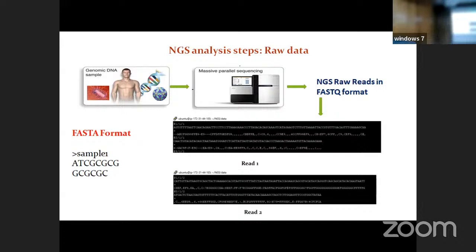So for example, you will take 3 samples. You can't expect that the false discovery rate will be significant. At that point of time, you should close your eyes on statistics. You should just look for fold change. You get my point? Okay. So another reason is that there is no clear-cut biomarker. Generally, it never happens. But if it happens, then you need to go for single cell technology. You should prefer single cell technology.